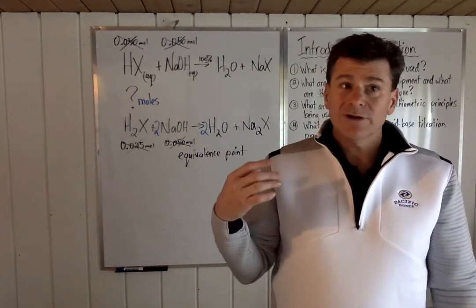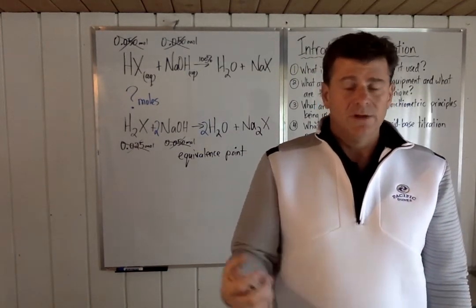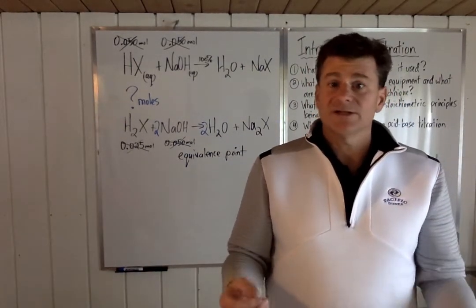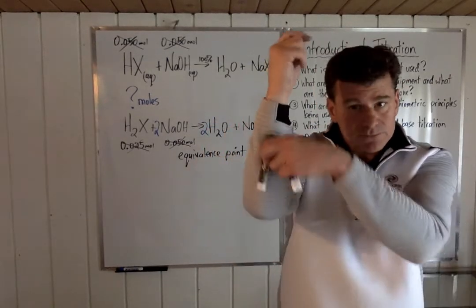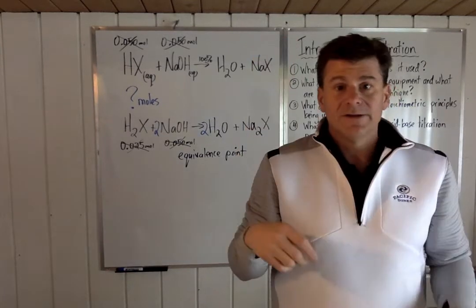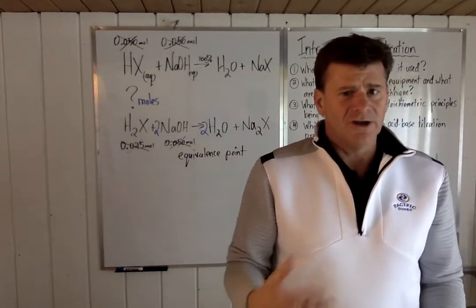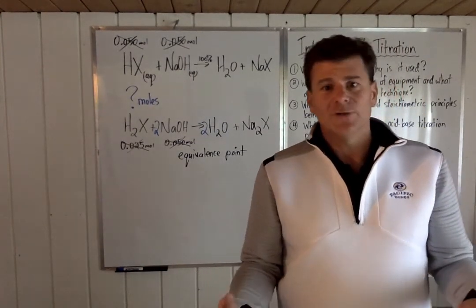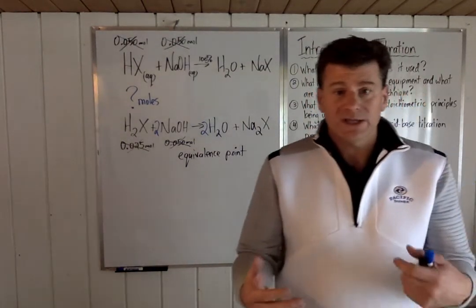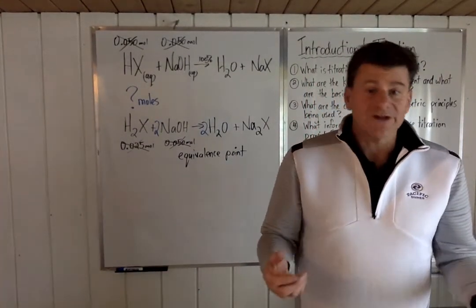However, you're going to have a really hard time knowing exactly when you're down to the molecule where that point is. That is a really hard thing to do, even in one drop out of a burette. If I'm doing my little burette and my valve is closed and I add just a little bit and drop out one drop, that one drop has a lot of molecules in it. I mean, we're talking chemistry. So even a drop has tons in it. And so it's really, really hard to actually hit the true equivalence point. As a matter of fact, you're not going to.